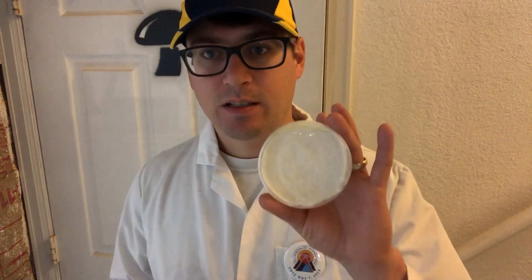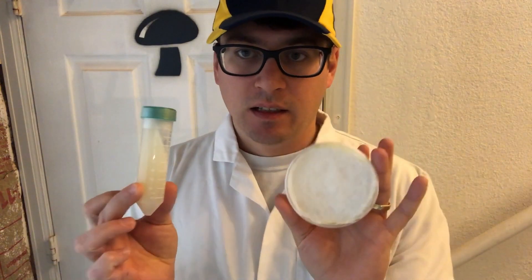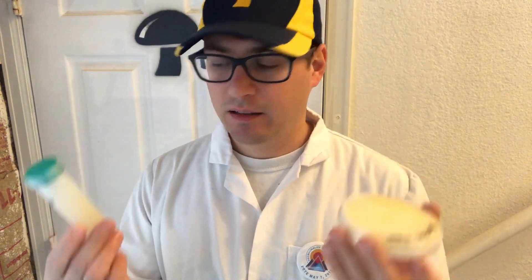What's up guys, it's Gary with Fresh from the Farm Fungi. I'm here in Denver, Colorado, and today I'd like to discuss the differences between plates and slants — two types of media containers or working vessels.